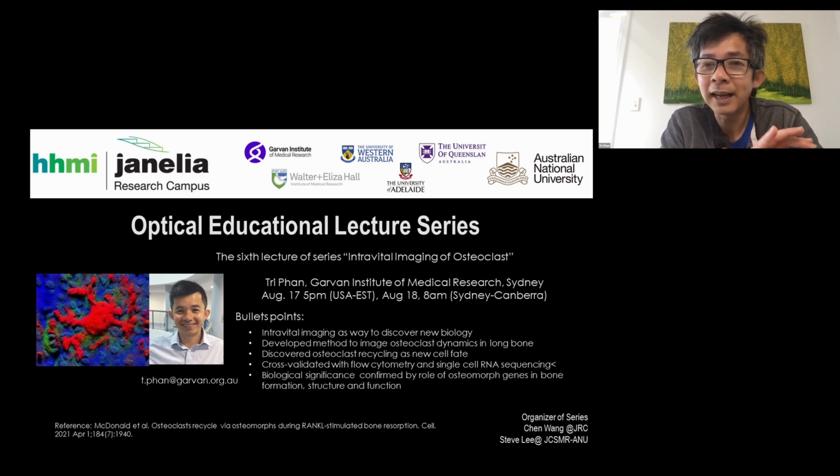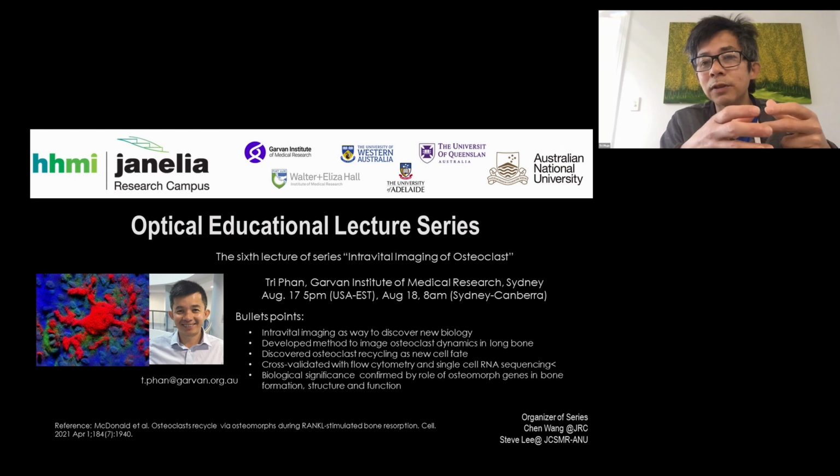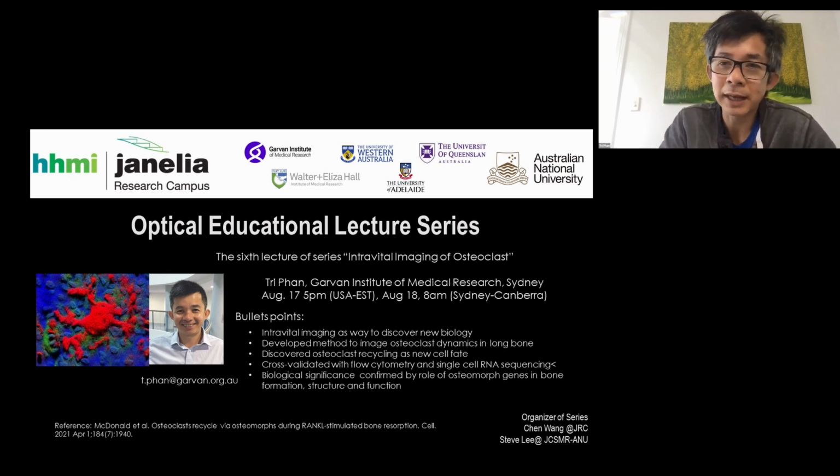refractive index. And I guess one of the other things I forgot to mention is that to try and overcome the big bulky objective, one of the things that we want to try and use, and Steve hopefully will build one for us soon, is a micro endoscope, that's a bit narrower, that will allow us to get closer to the tissues. But yeah, no, so you're right, we're using the wrong immersion liquid.